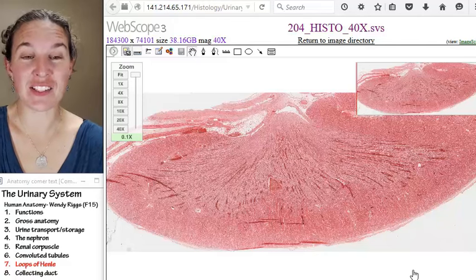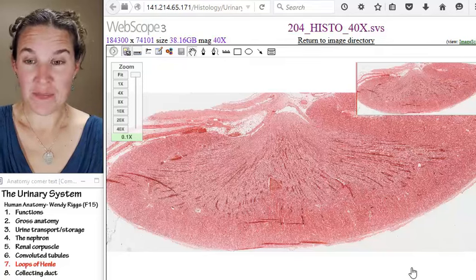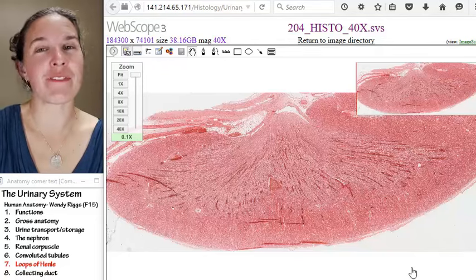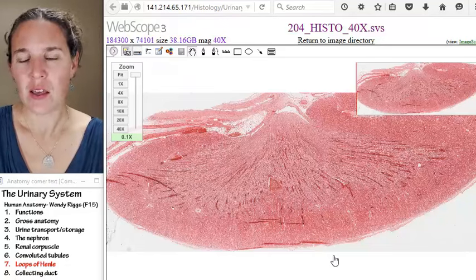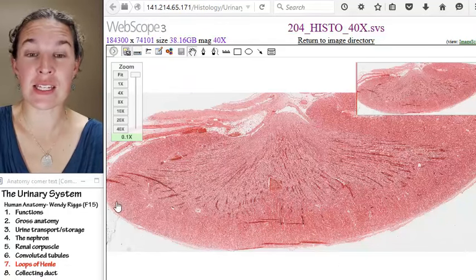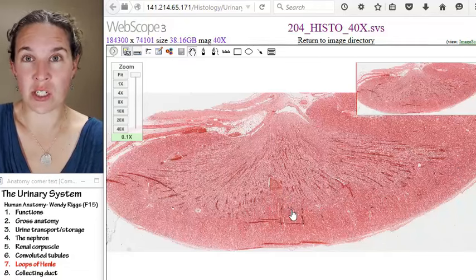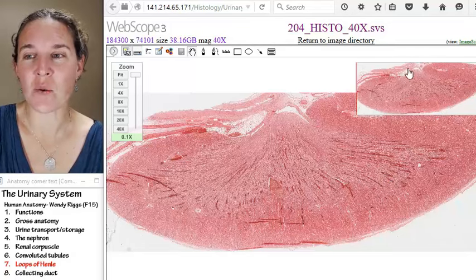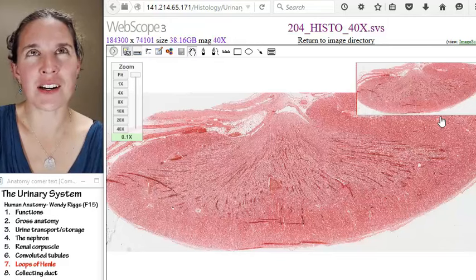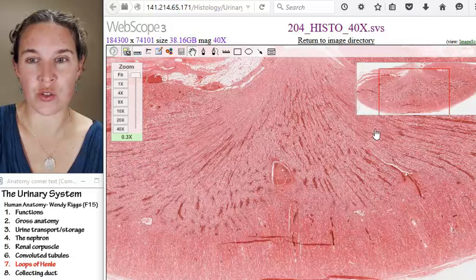In order to take a look at our loops of Henle, I'm going to take us to my favorite place: the University of Michigan histology site. These guys are amazing. You can actually see the entire kidney and mess around just like you can in lab with your slides. It's nice because they always leave you a big picture and give you a little red box to show you where you are zoomed into.